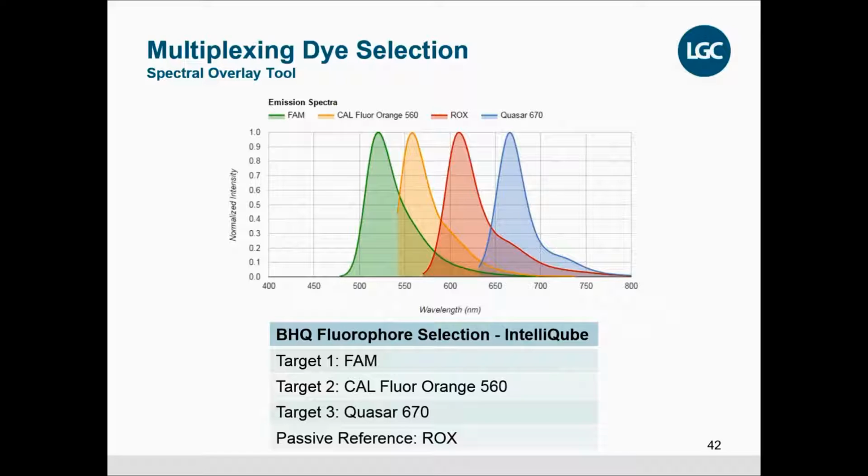Primer concentration is very critical as part of the optimization process. Typically, a reduction in primer concentration is going to be necessary, and if you have a very highly expressed target, we can limit the primer concentration of that target, so that's not using up a lot of the materials in your reaction.